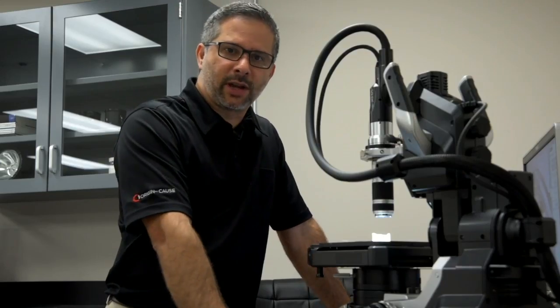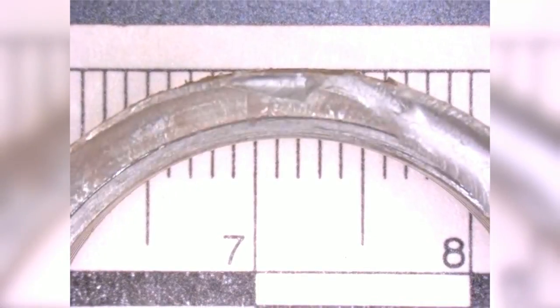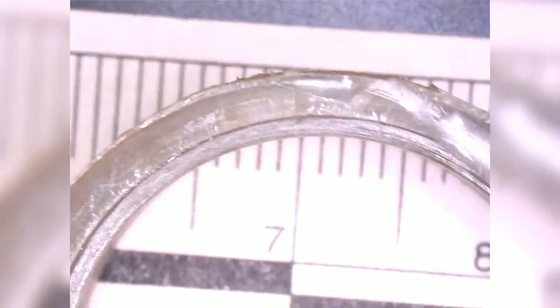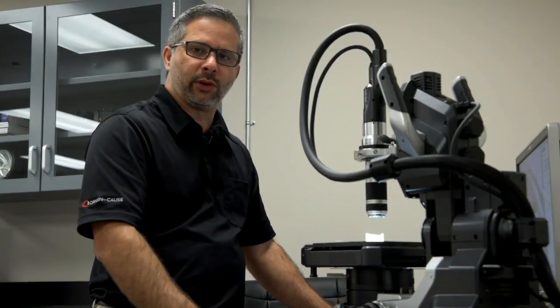So now we're here at the microscope, and we want to understand how this failure happened and why it happened. Basically, what I see here is very characteristic of creep, and now I'm going to document in more detail all of those features that I see.